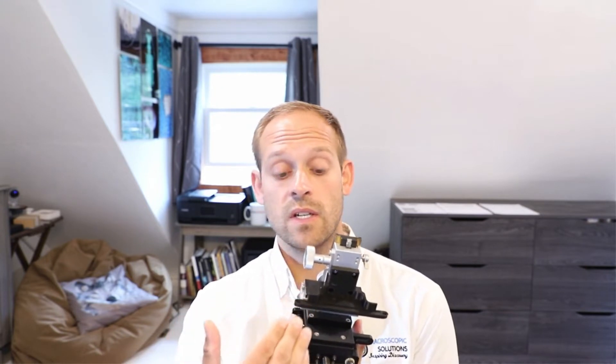This type of stage is also designed with a little slit, so if you felt inclined you could place a microscope slide directly on it and use it as a supplement to your microscope. You can then photograph whatever is located on that slide with this stage configuration.